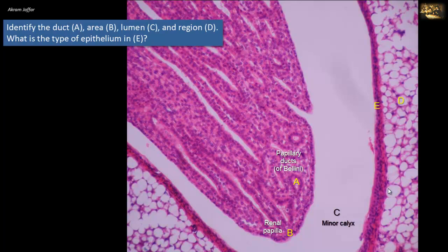The space C, the minor calyx, as elsewhere in the renal excretory passages, is lined by urinary transitional epithelium marked by E. Though it is thin here — about two cell layers thick — the wall of the calyx also contains a very thin layer of smooth muscle fibers, which contract to force urine into the ureter. D is a region outside the pelvic caliceal system showing an abundance of fat cells. This is the fatty tissue of the renal sinus, which extends into the kidney from the perinephric fat.